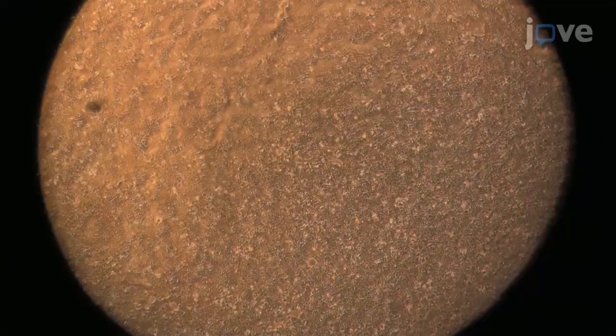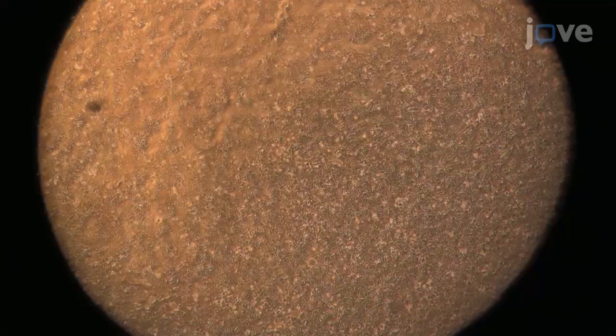Under a microscope, confirm tumor cell growth and count the cells in culture. Using an ultra-low adhesion 96-well plate with concave round bottoms, seed 5,000 primary tumor cells or 1,000 to 2,000 cells.